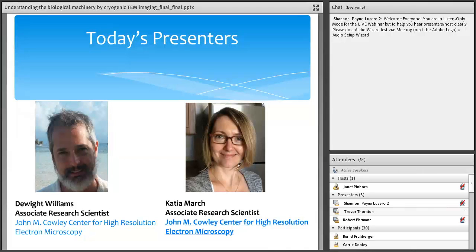We came from a world where a lot of people discounted us as blobologists, and we're now moving towards more structural information that is more acceptable to the community at atomic resolution. Yeah, and it's a pleasure to be there with you and to help you ask some questions and to discover what is the cryo-TEM.